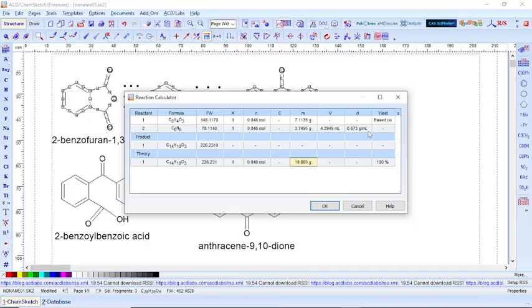So with this, you just have to use your graduated measuring cylinder and measure accurately 4.2949 mL of benzene. Keep it aside. That means you have gotten your starting reagents. Good. All right. So I will pause a bit to see if there is also a question to ask.